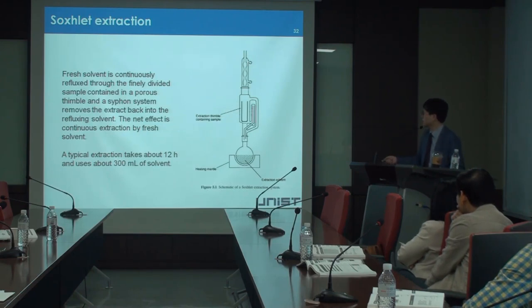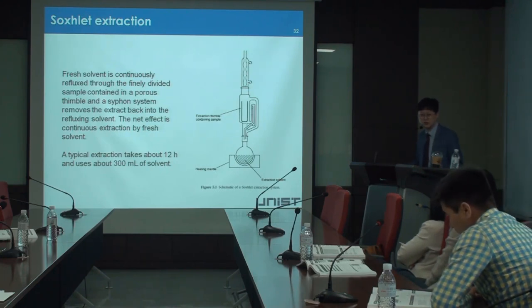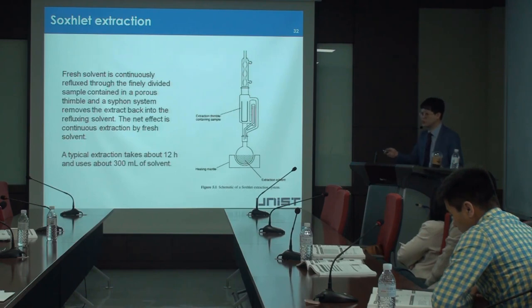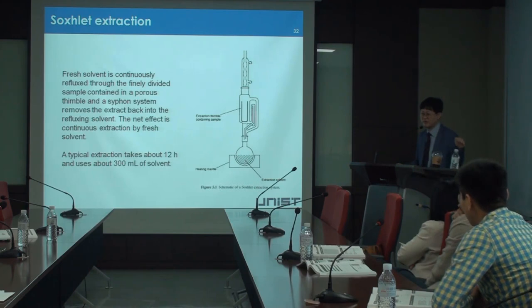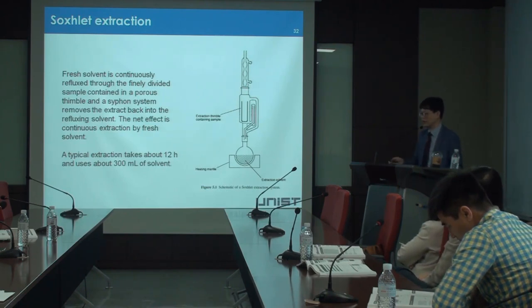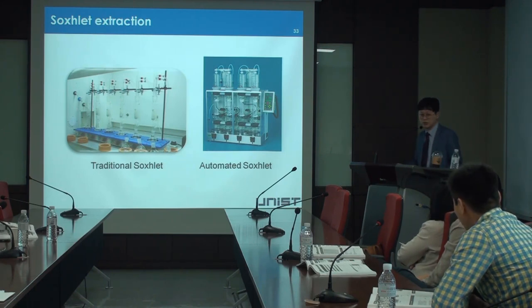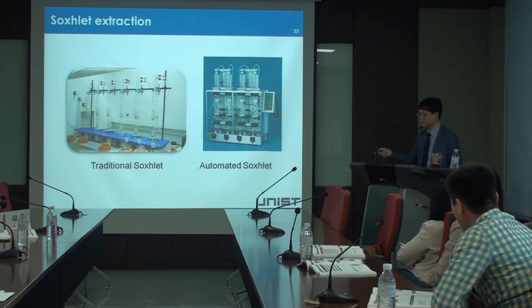Soxhlet is the name of the inventor of this instrument. So when we use this word, Soxhlet, the S should be capital. Soxhlet extractor or Soxhlet extraction. Any type of name like this, you have to capitalize. So this is a real protocol for the Soxhlet, and this is an automated Soxhlet. This is much more expensive than this one. This is relatively cheaper.